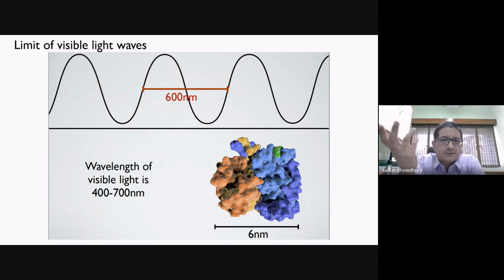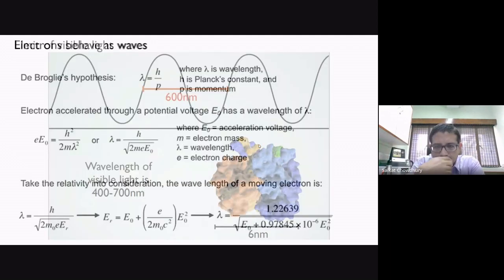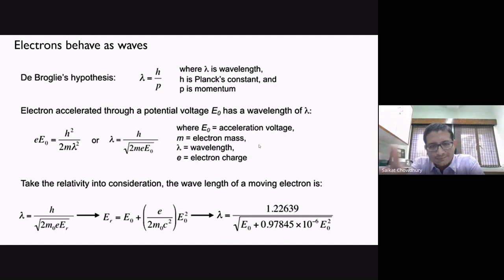That's primarily because visible light is at bigger wavelengths. For example, somewhere between 400 to 700 nanometers is where your visible spectrum lies. So you cannot see things which are really tiny, smaller than the wavelength of this light. That's when we need something with a wavelength comparable to the dimension scale that we are interested in looking at. I won't go too much into the math and details.